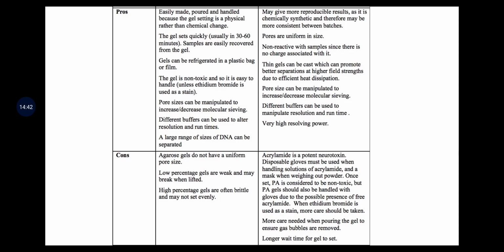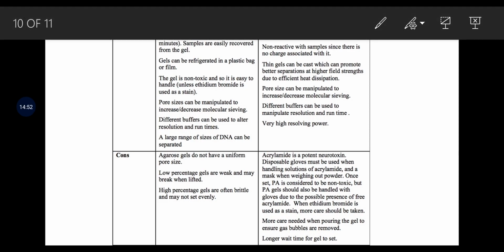Pore size can be manipulated to increase or decrease molecular sieving. Different buffers can be used to manipulate resolving and runtime. Very high resolution power is obtained in polyacrylamide.